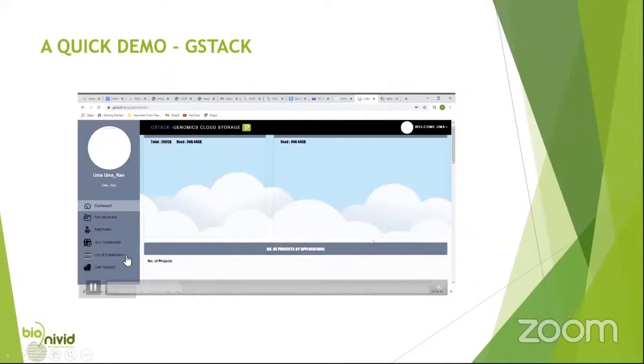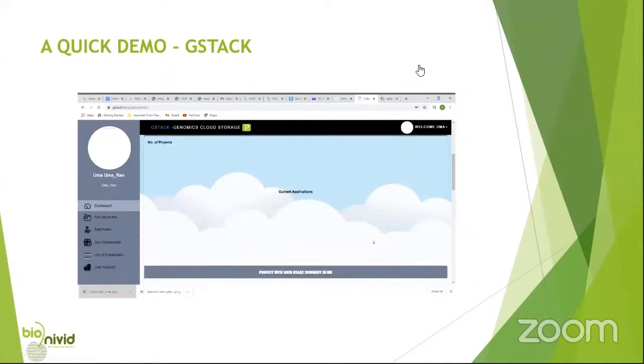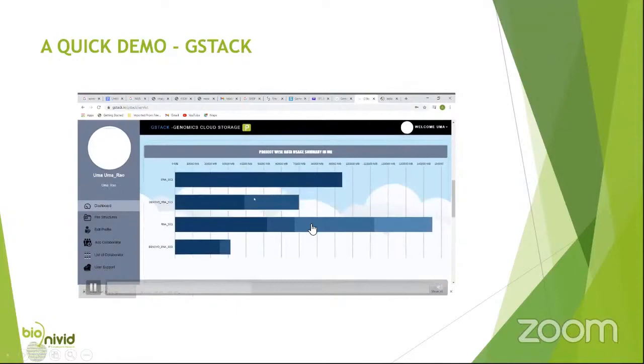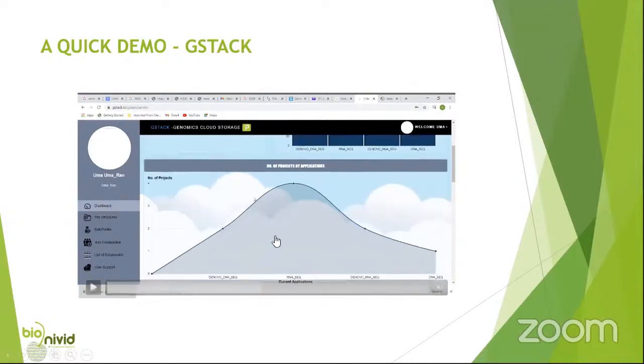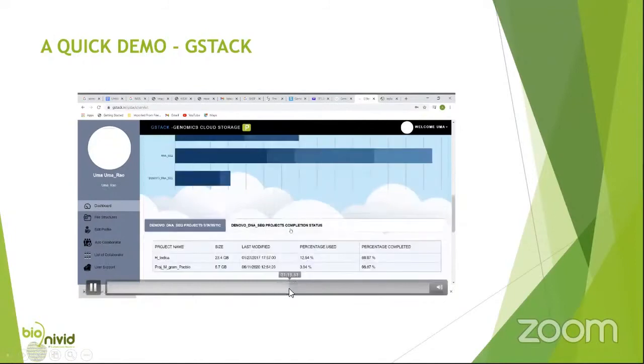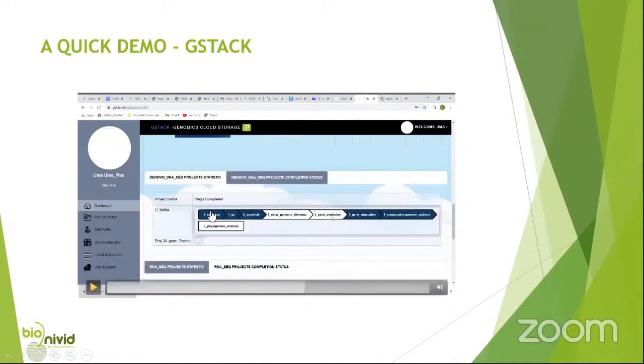this is your interface that you are led to, and this interface will give you all insights regarding the various projects that you have loaded in your allocated space, the size that they have occupied, the percentage that they have used, the stage till which the analysis is complete, various applications, and the amount of data that each of that application is utilizing. Everything gets covered here. So this is your project management platform, wherein you get to keep an eye on what stage your project is into, how much data is each application occupying, so on and so forth, right? Also, here we are talking about the typical stages that are involved in your project, and what all have been completed, what all are going on. So you get an insight into that as well.